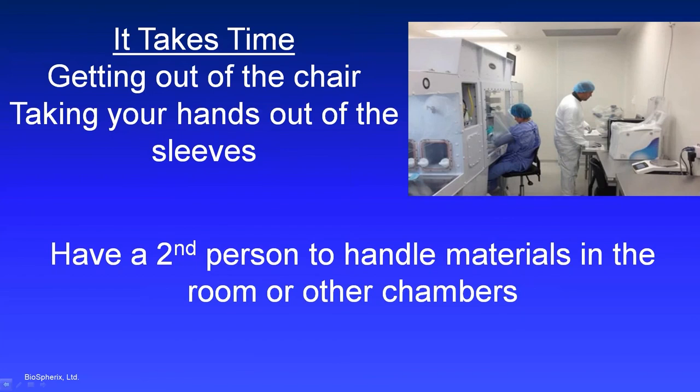All right, now it takes time to get out of the chair, get your hands out of the sleeves, go find something in the room, get it into the Xvivo system, or move things around from chamber to chamber. Those of you that are working in the GMP world are used to having a second person in the room that's doing things like documenting your actions inside the Xvivo.